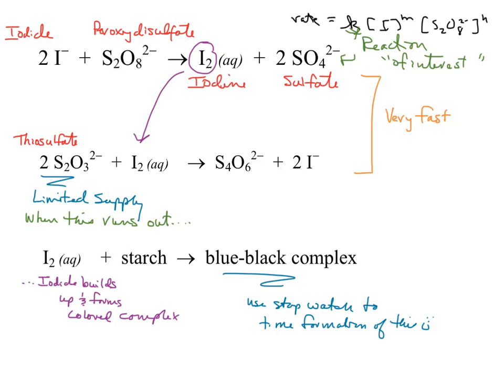Your instructions say go ahead and grab 3 50 ml beakers, cute little beakers. If you need some more, there are definitely some, I think, behind the screen there. 3 50 ml beakers. You want to label what they are, because over here, these two are kind of together. These go in your A's, okay? These are the 2 things that go in your A's. This goes in your B in various amounts. Notice in your B also, you're supposed to have some kind of makeup water sometimes, okay? So sometimes B gets water. Are there any questions about that? Okay, I think you guys will do great.